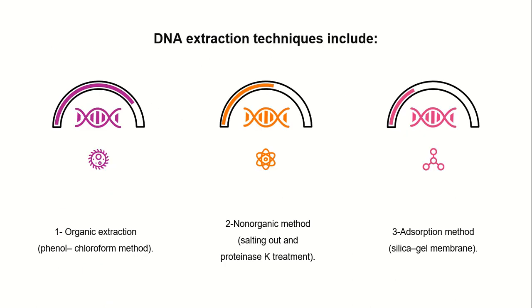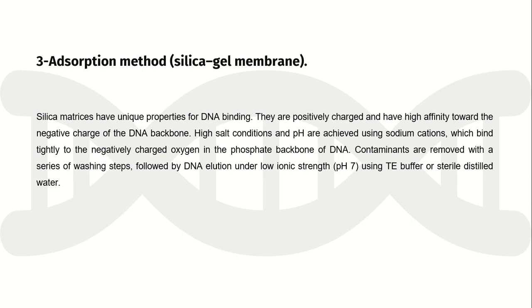DNA extraction techniques include: number 1, organic extraction, the phenol-chloroform method; number 2, non-organic method, salting out and proteinase K treatment; number 3, adsorption method, silica gel membrane. Now I will focus on the silica gel membrane method, which depends on adsorption.